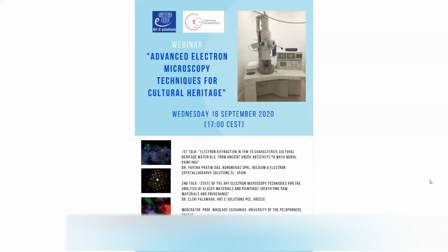imaging, phase and orientation mapping, spectroscopy in TEM and SEM coupled with cathodoluminescence, etc. And we'll discuss recent case studies from the field of cultural heritage.